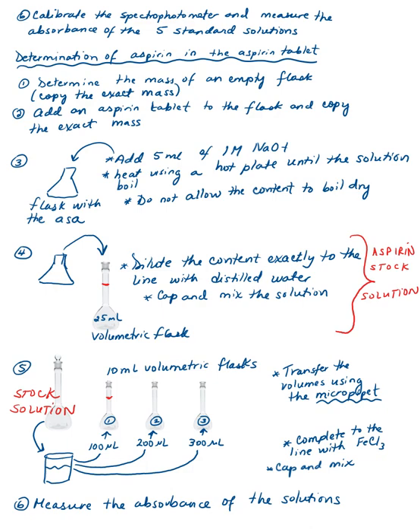Mix everything in the same beaker, clean everything with water, soap water, and distilled water, and put everything back to the original location. The beaker containing all of your waste, you can transfer that waste into the waste container in the fume hood. Make sure that your distilled water bottles are refilled before you finish with everything.